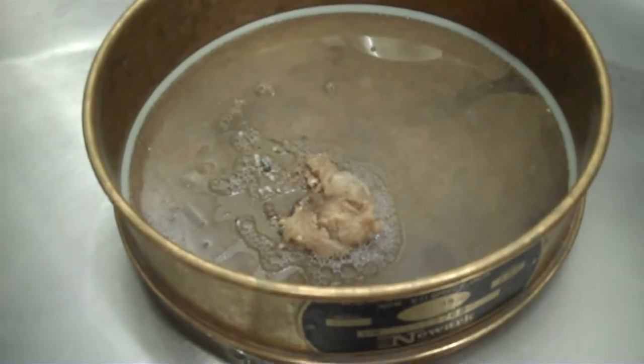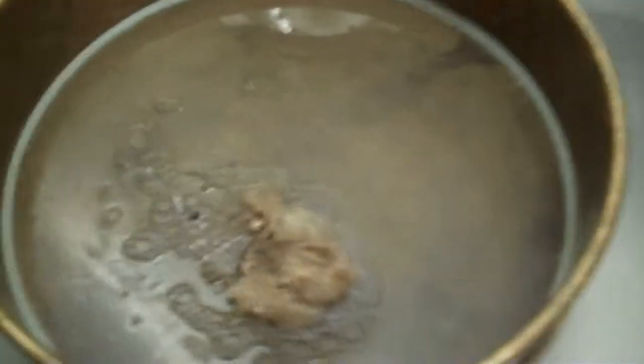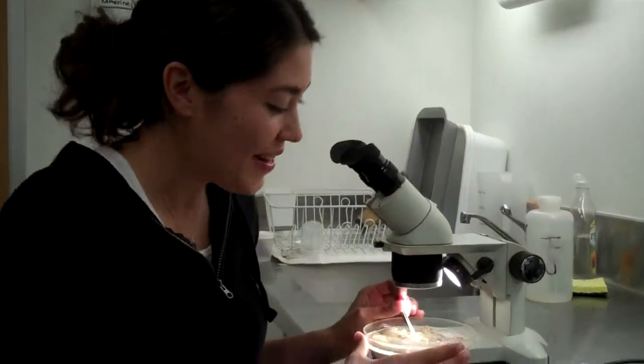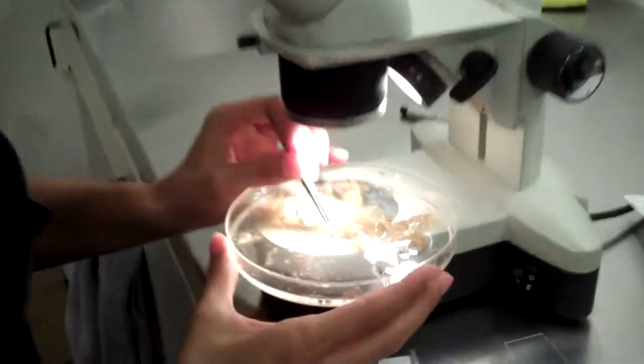We're particularly interested in otoliths, which are fish ear bones. These will tell us exactly what types of fish the birds are eating. And now for the fun part — we begin by pulling otoliths from the mucus.